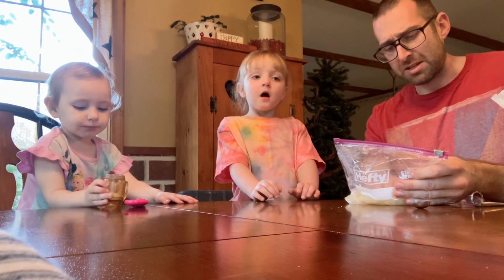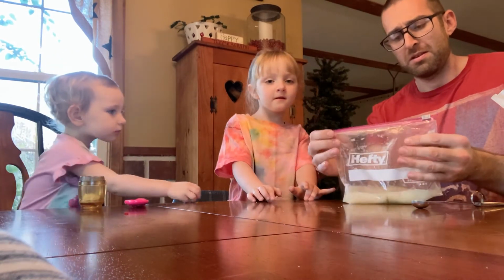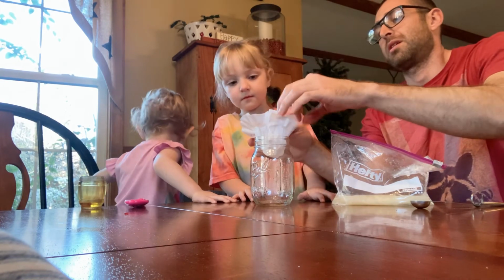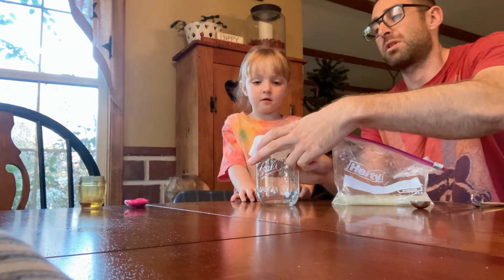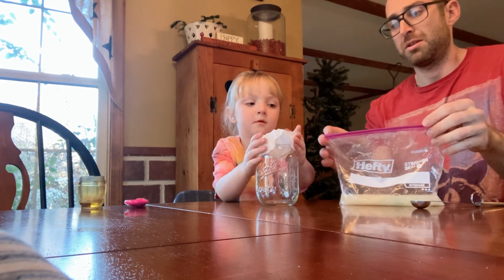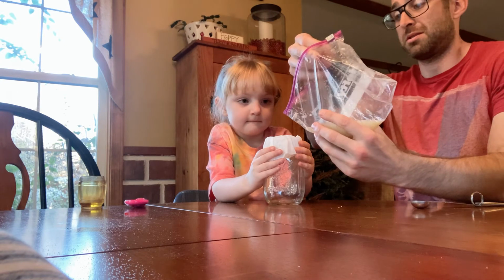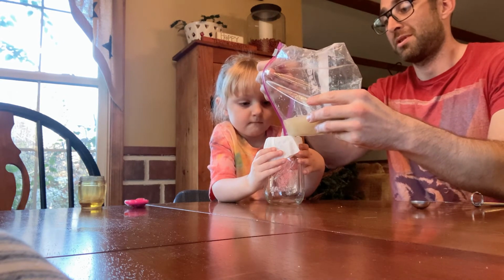But what we're going to do next is we're going to pour this in here. Yeah, so this is a coffee filter. And we're going to try and make sure this coffee filter doesn't move when I pour that in. So that might be your job to hold it a bit. Ready? Okay, so we are going to now pour our contents into here.